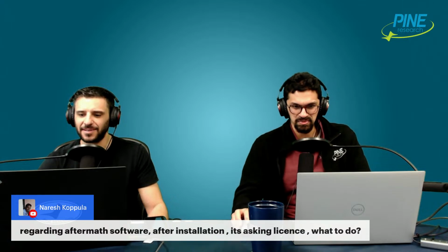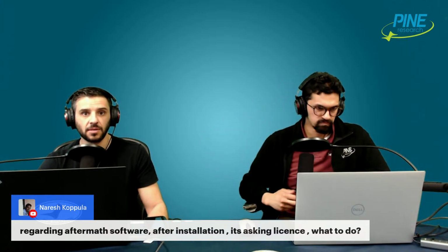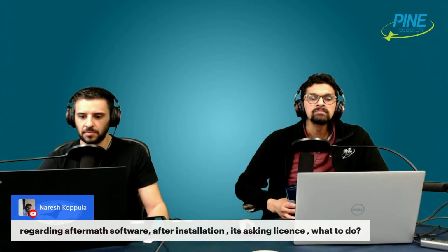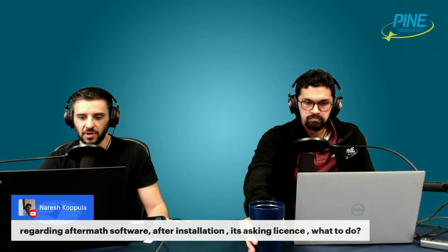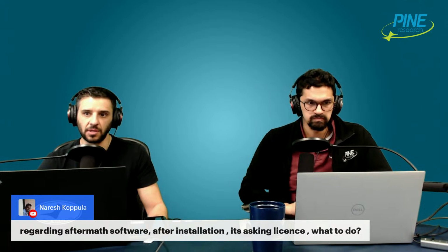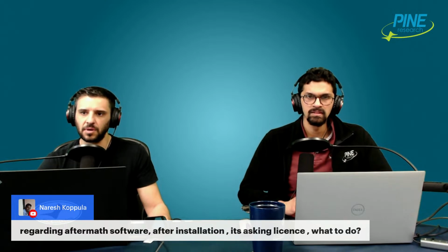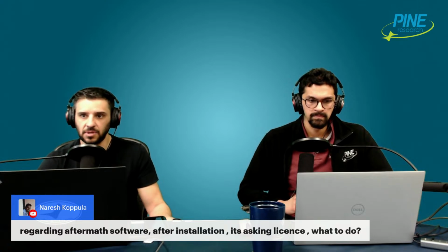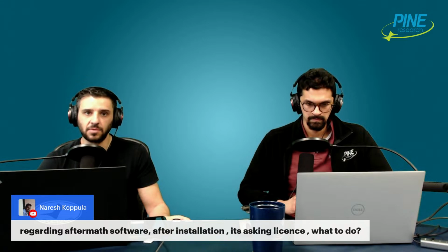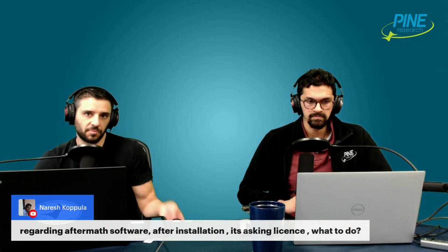Okay, that's my tirade. Naresh has downloaded Aftermath. I assume Naresh, you've downloaded it from our website. Our software can be downloaded from our website for free, but many of the features need a license. If it's asking you for a license, you can purchase a license, or you can use it without one. You can still import data. You can create a new archive, add a new plot, and copy and paste data into it and do some of the analyses that I showed today. You can't do EIS circuit fitting or electrochemical simulation. Those require a license, and we sell licenses for those.